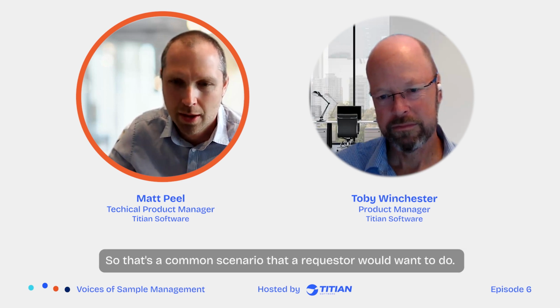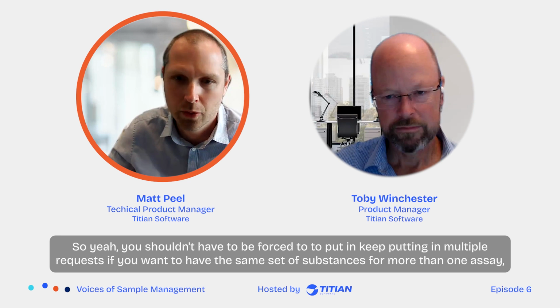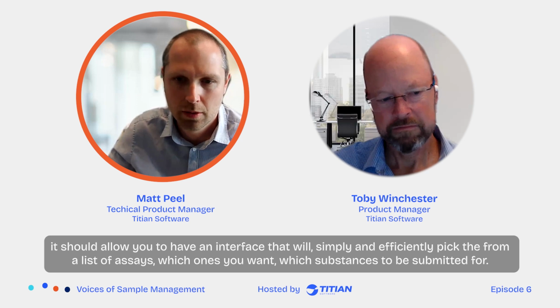That's a common scenario that a requester would want. So the system should have an interface for that sort of assay requesting. You shouldn't be forced to keep putting in multiple requests if you want to put the same set of substances into more than one assay. It should allow you to have an interface that will simply and efficiently pick from a list of assays which ones you want which substances to be submitted for.